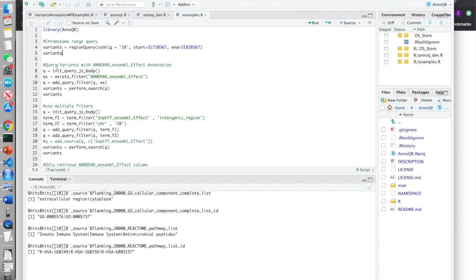Inner functions don't complete the task, but they are components. You can combine them together to reach certain functions. If you want to query variants with only one column here, you can use those component functions.